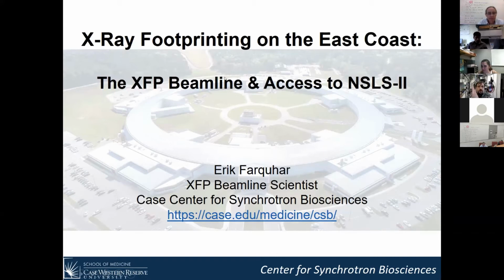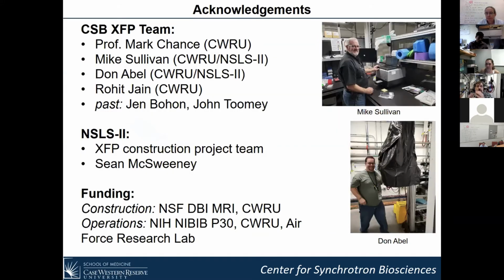All right, so I'm going to say a little bit about X-ray footprinting on the East Coast. Corey gave me 15 minutes, so I'll tell you a little bit about the beamline, how it differs from the ALS resource, and then say a little bit about access to NSLS2. First off, I'm going to start with the acknowledgements.